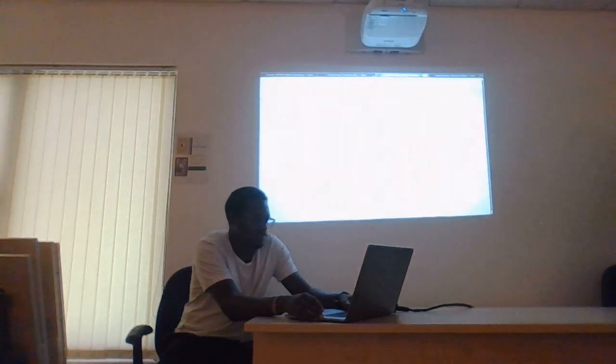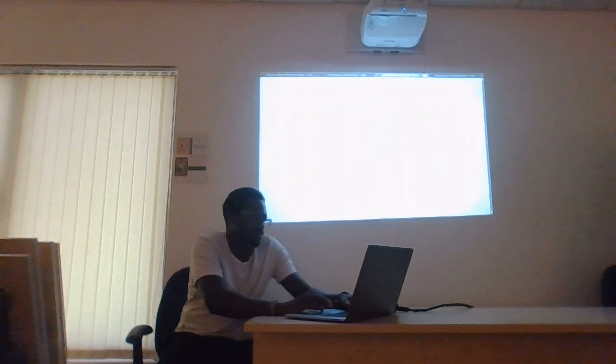So we can try and execute this. Let's see what it does. So what we've required it to do is just print this line starting with reads and the parameters of the reads.